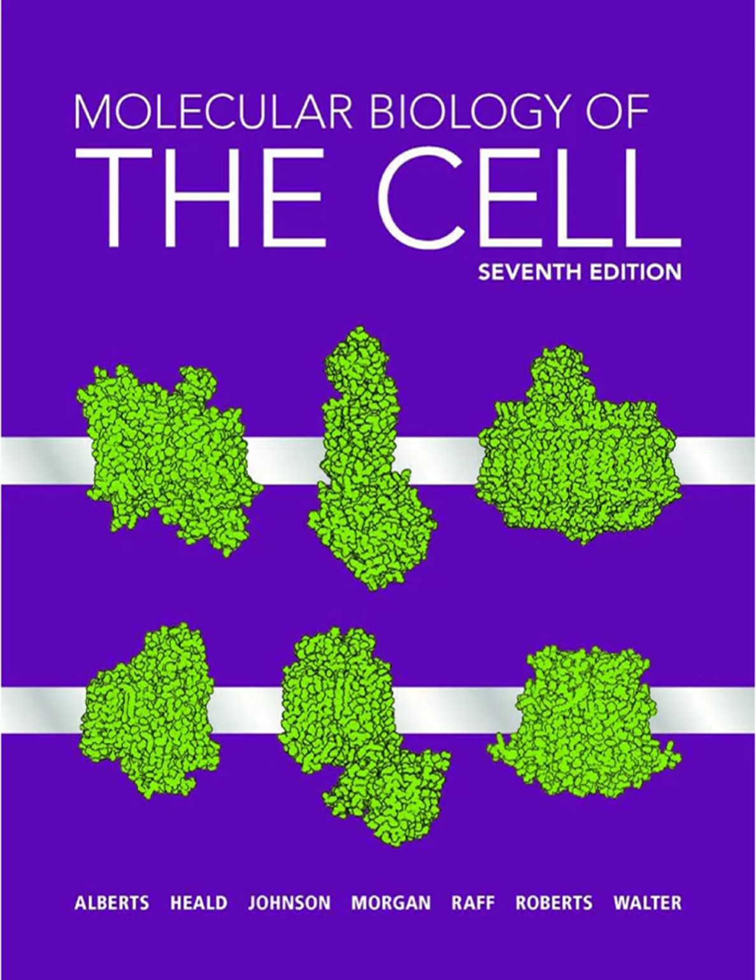Okay, shifting focus a bit. Right. A big challenge with any conventional microscope, looking at thicker things like whole cells or tissues, is blur, right? Light from above and below the focal plane fuzzes up the image. Absolutely. Out-of-focus blur is a major limitation. It obscures detail. So how do you get around that to see a crisp slice? There are two main strategies. One is computational, the other is optical.